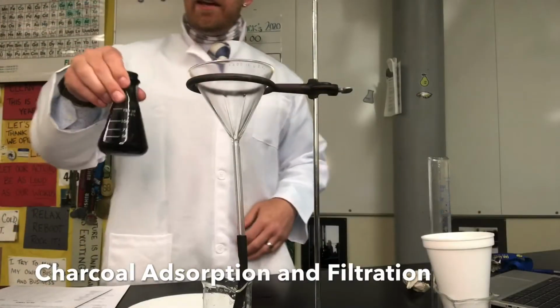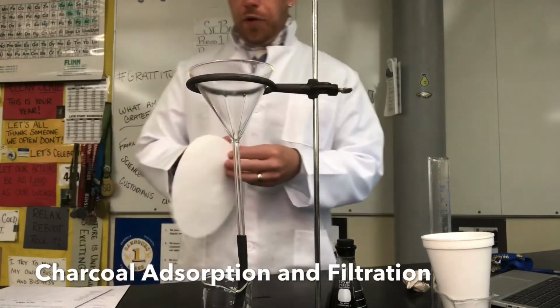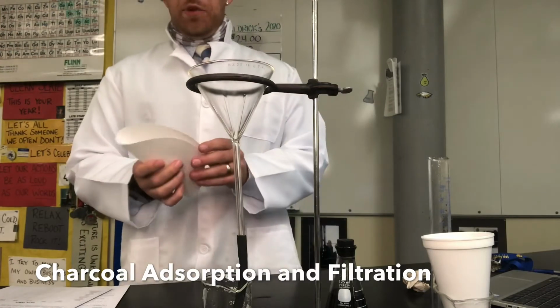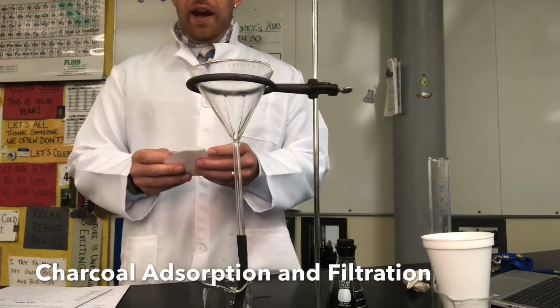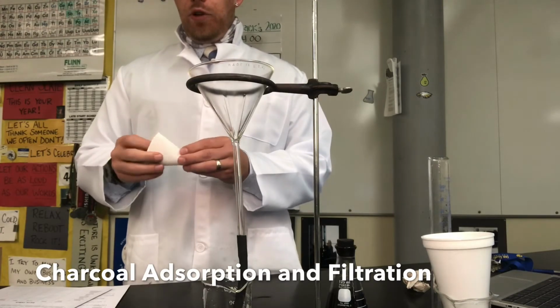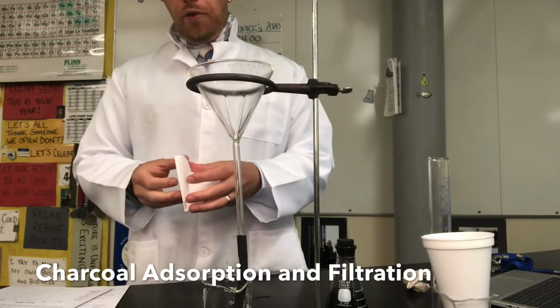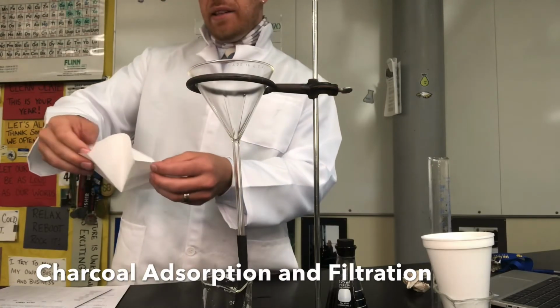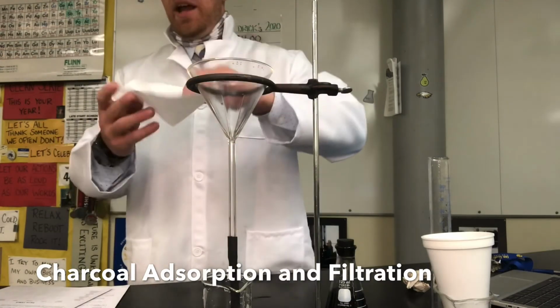So we've shaken our water, I think, enough. So I'm going to show you how to set up a little filter paper action here. So when I have these white circular filter papers, I'm going to fold it in half like a taco. And then I'm going to fold it in half again, to make it look like a slice of pizza. Then I'm going to fold it in half again to make it look more like an ice cream cone. But when I unfold that, it's now made these natural edges that can accidentally fold over each other to make this round cone-like shape.